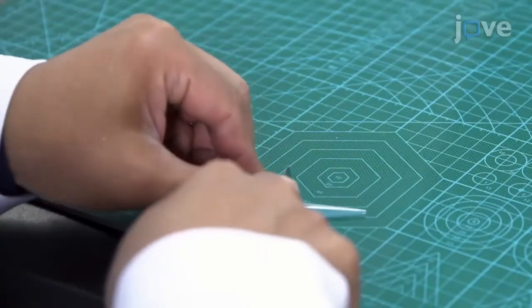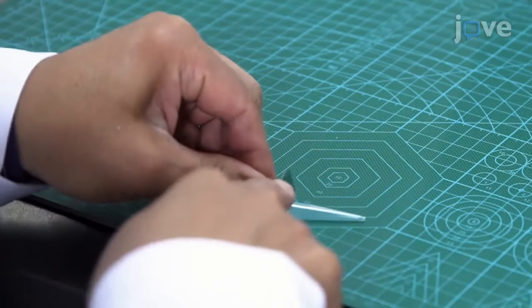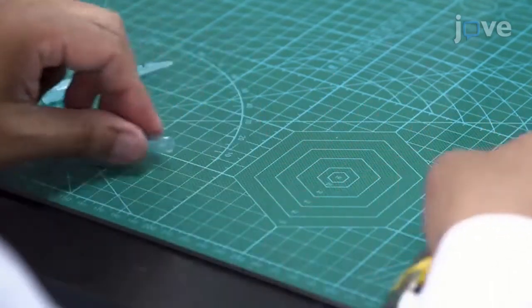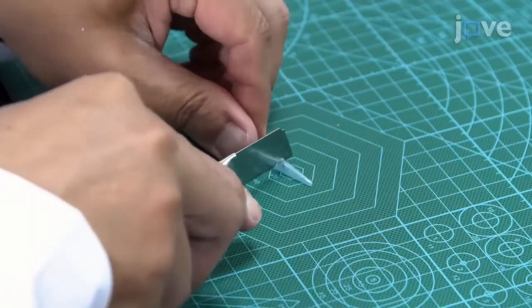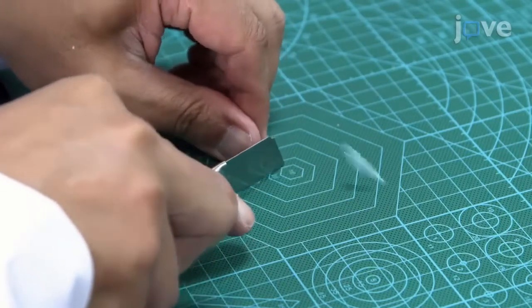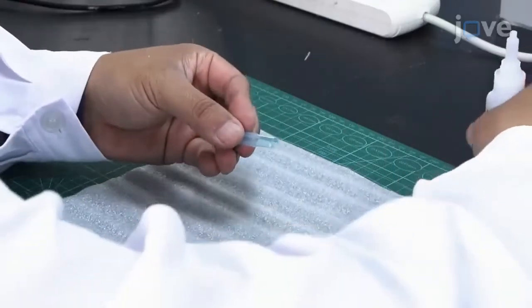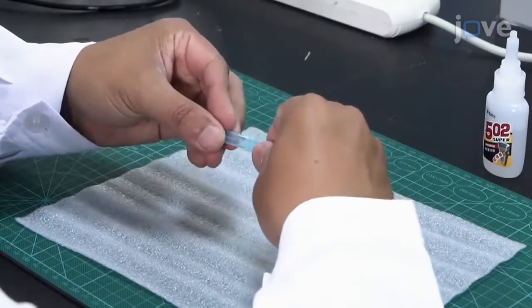Use a sharp knife to cut one 1 mm micropipet tip transversally in half, and cut 1.5 cm off the tip of a second 1 mm micropipet tip. Glue the pieces of the two pipet tips together with an all-purpose adhesive.